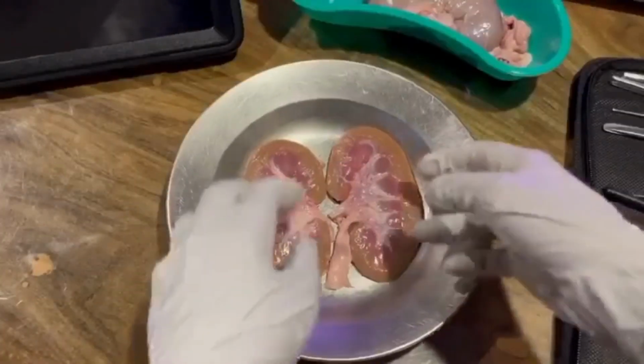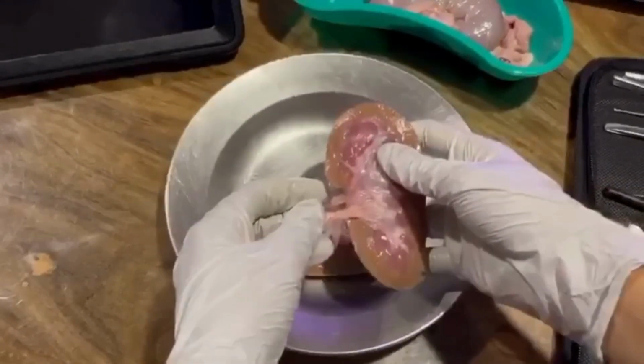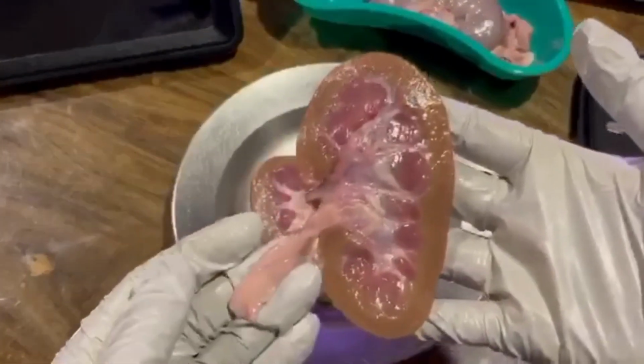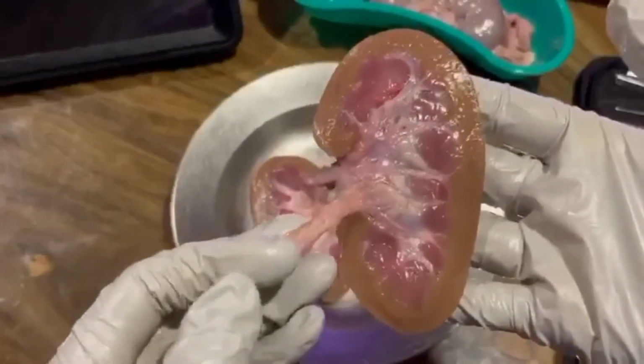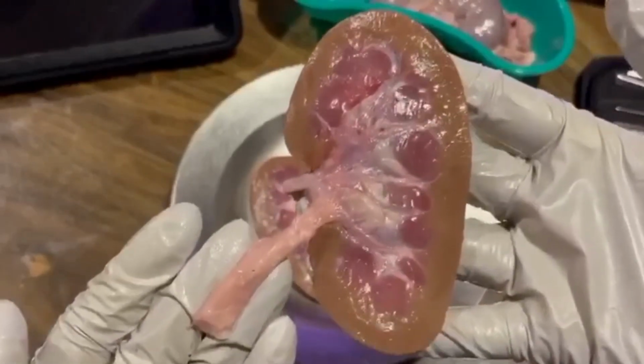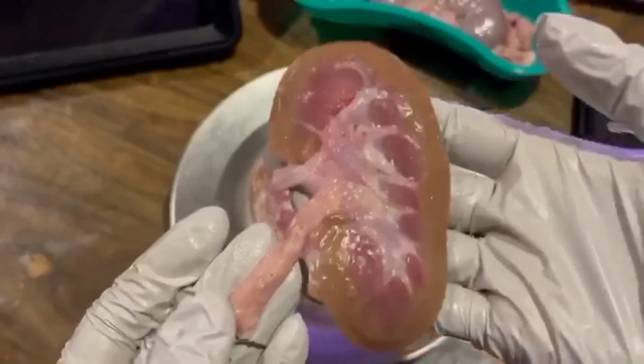Let's go now with the ureter. Here in the pig's kidney dissection, the ureter is a crucial structure that plays a vital role in the urinary system. It's a muscular tube that connects the renal pelvis, the central cavity of the kidney, to the urinary bladder. During dissection, you'll find the ureter as a tube extending from the kidney towards the bladder.